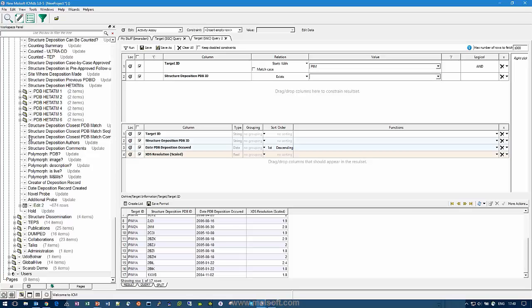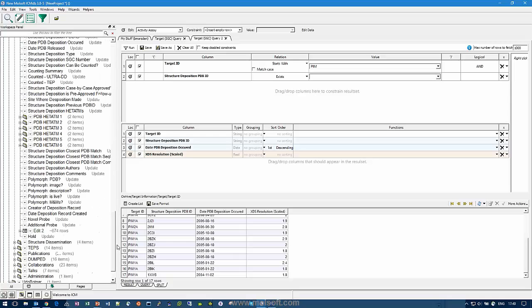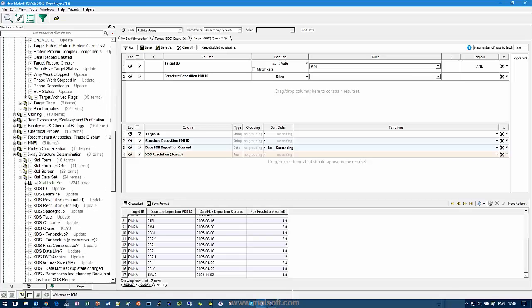Okay. Great. Another one, kind of similar, is how can you see the relevant ELN page from a Scarab query? Yeah, great question. I should have shown that as well. So let's see if I can find an example of that. So I'm going to extend this query now, and I'm going to put in, let's see if I can find what I'm looking for before I say it.